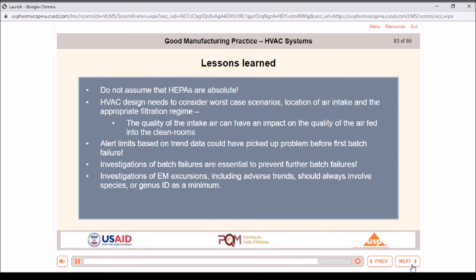It is best practice to retain EM plates and store them at 2 to 8 degrees Celsius until any associated in-process or final product microbial testing has been completed, as this can help any subsequent investigation.